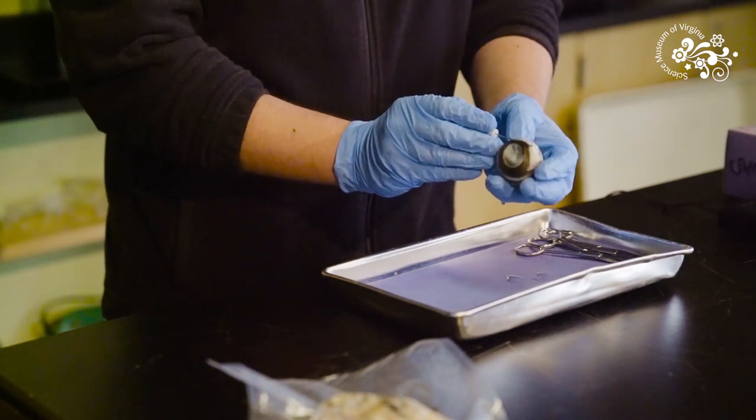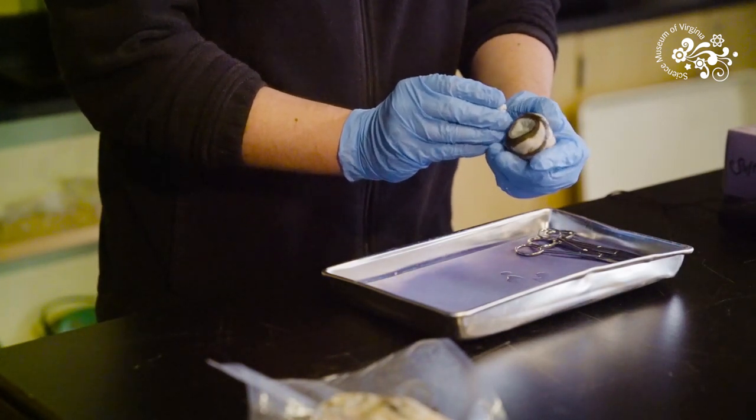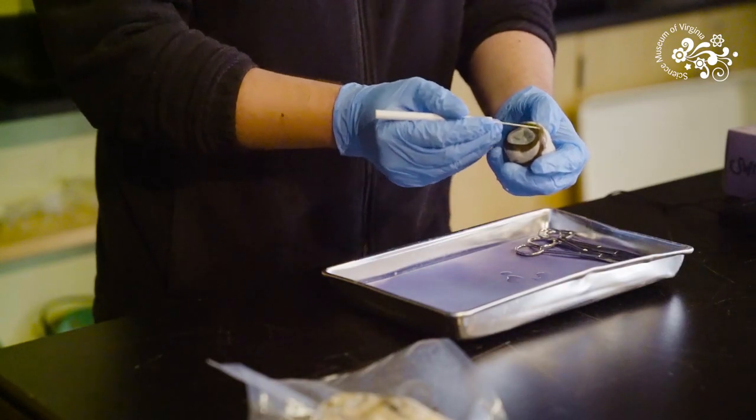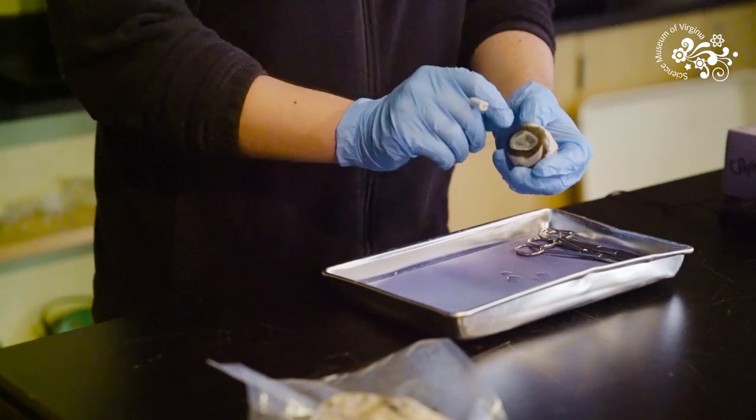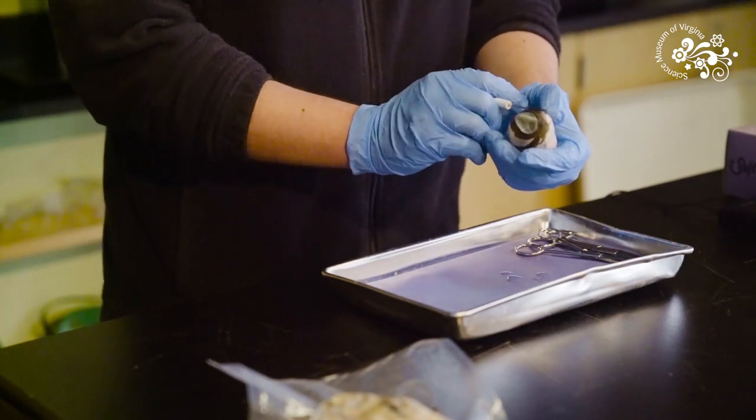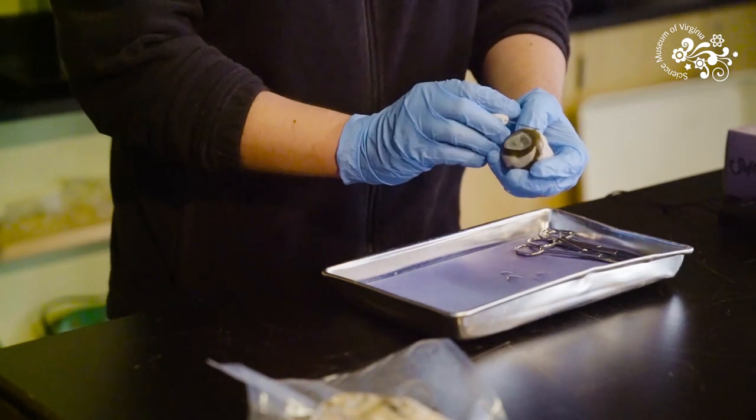Around the side of the eye, this part here is the sclera, which is pretty much like the white of your eye, though some animals have more pigment in their sclera than we do. This is really tough leathery tissue and is what we'll have to cut through to reach the inside parts of the eye.